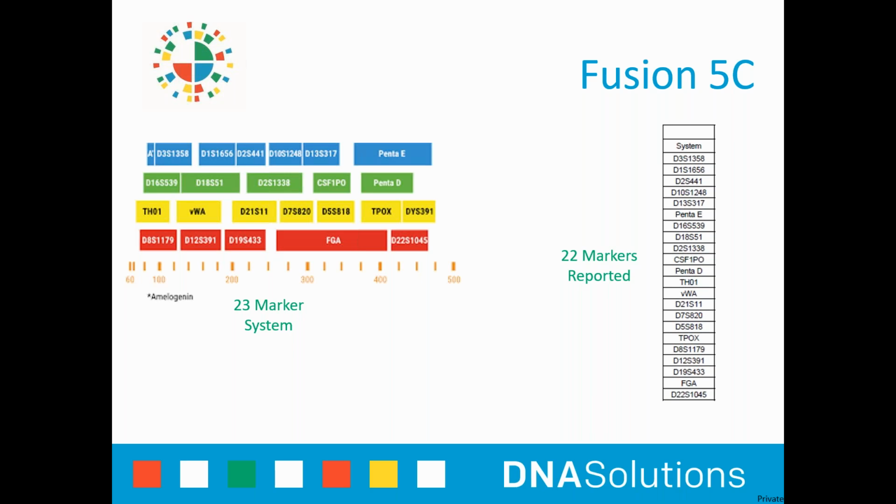These are the 23 markers we use. It's actually 22 markers plus amelogenin, which is the sex discrimination marker. You can have more markers. There are a few systems with more markers, but in second degree related kits, you do need more markers. So 13 was the original most people started with, now 23. But you only get an improvement in the discrimination up to a certain point, and most of the commercial kits now have settled between 18 and 25.